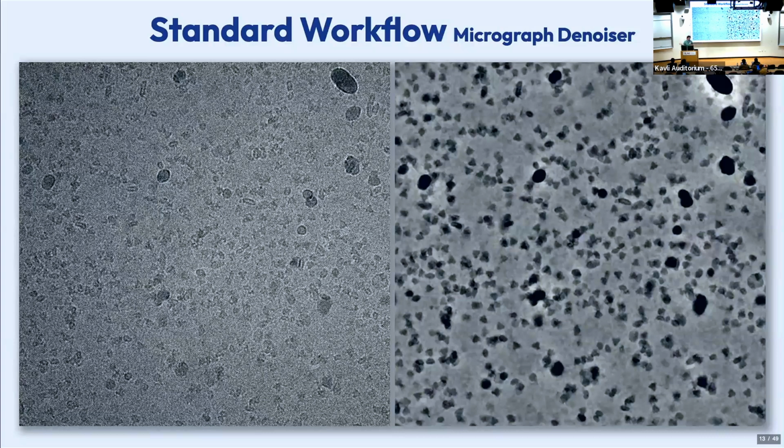The second part, what do we use it for? In this case, I blob picked and template picked on the denoised image. And we have found that basically that increase in contrast, even though traditionally you would use these denoised images just for deep pickers, things like Topaz or Cryolo, for instance, blob picking and template picking also benefit. So I recommend doing it basically from the get-go.